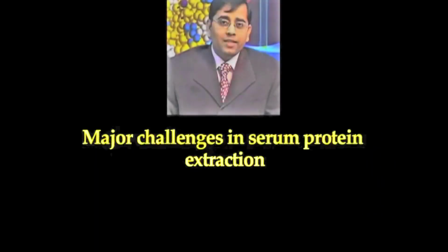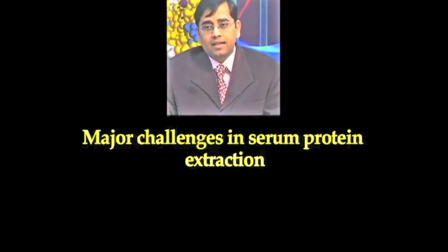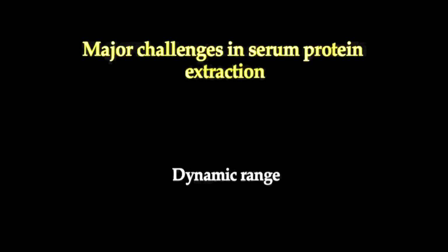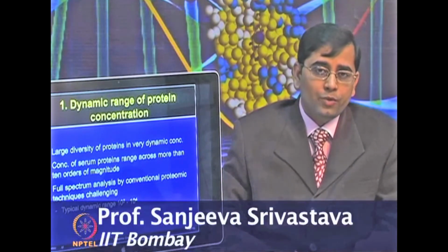Although sample removal is easy, sample analysis, the serum or plasma proteome analysis, is not so easy. There are major challenges in serum or plasma proteome analysis. Let us talk about some of these challenges point-wise.